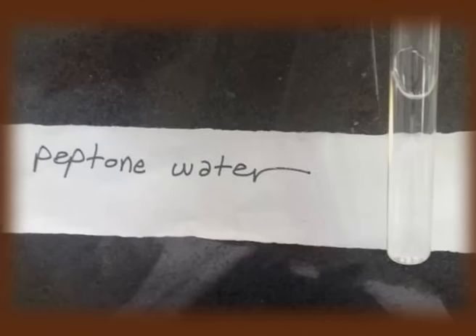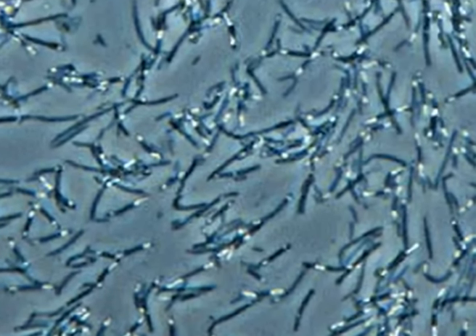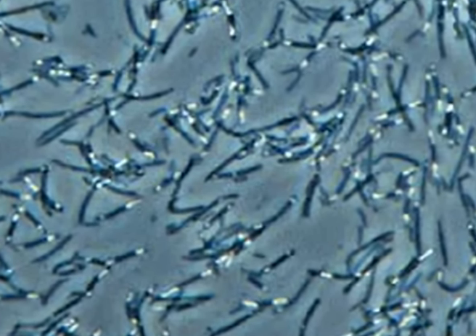The other example of basal medium is peptone water. Peptone water medium is a type of carbohydrate fermentation medium, and it is used to study water microbes. It contains peptone and NaCl mixed in a defined volume of water and adjusted to pH 7. Now let us move to the second group of media which falls under this category of functional use, that is minimal media.